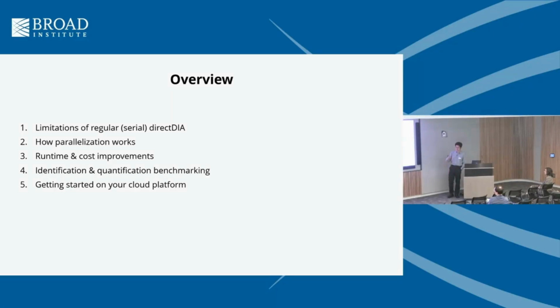First, I will transition into the limitation of the regular directDIA when we were running it in a sequential manner. And then I'll explain how parallelization works. And then I'll do a head-to-head comparison in runtime and cost between the serial directDIA and parallelized directDIA. And I'll do a benchmarking on the identification and quantification because we wanted to make sure that after parallelization, we're getting a consistent result compared to the serial directDIA.